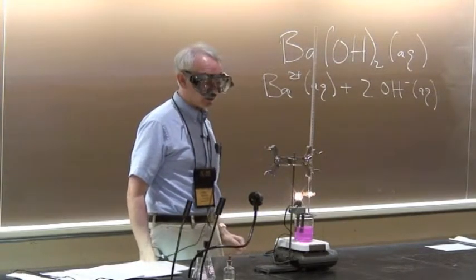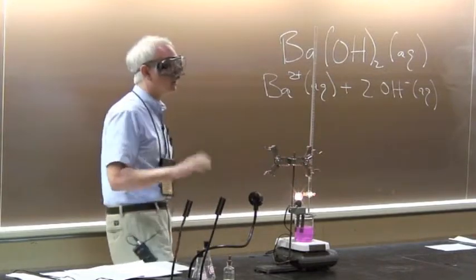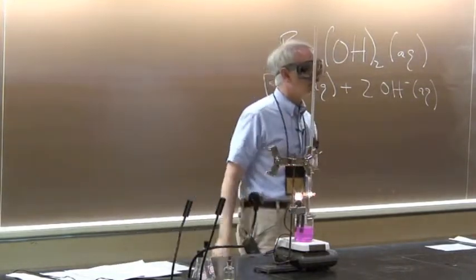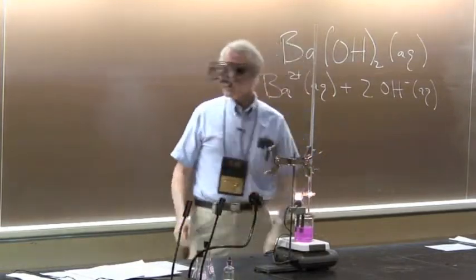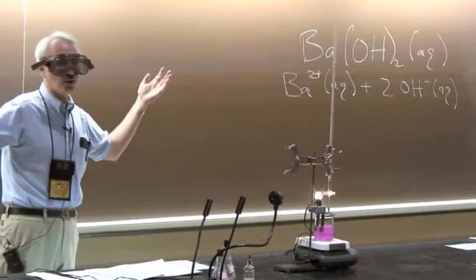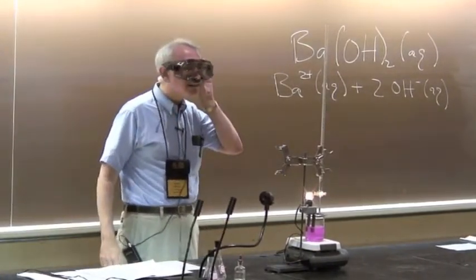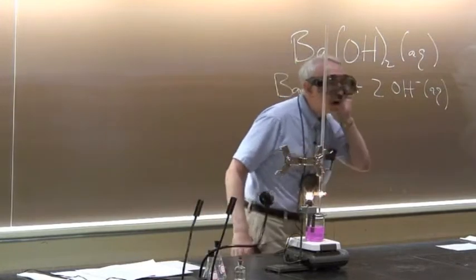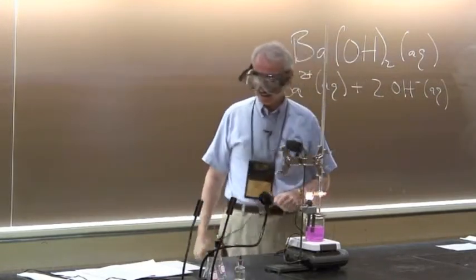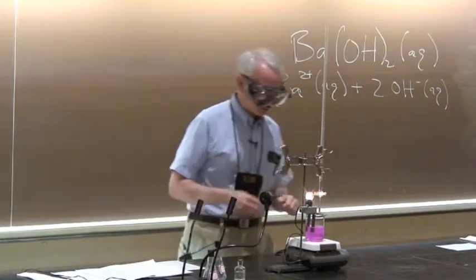Go away slowly. Well, I'm going to add a little bit and turn off the stopcock, and then we're going to see what it settles down to. And is anything else going to happen? Will we see anything? An explosion, maybe? A precipitate? Jenna thinks we're going to get a precipitate.